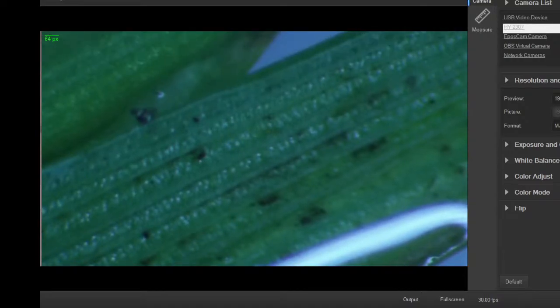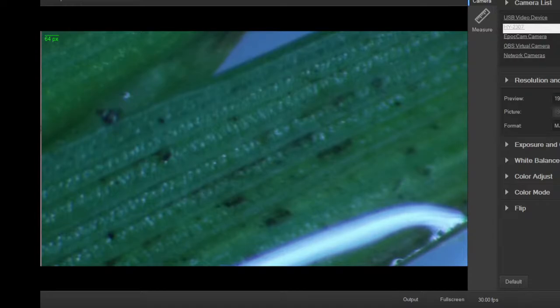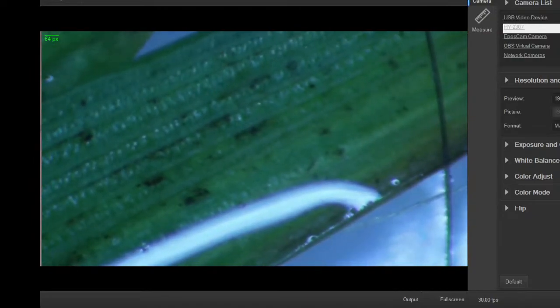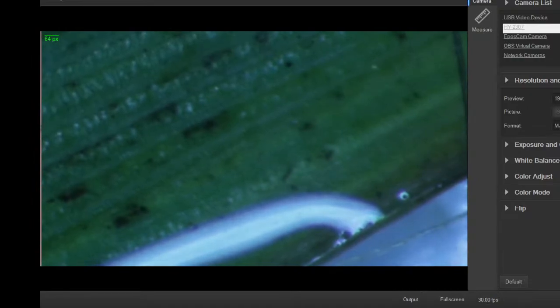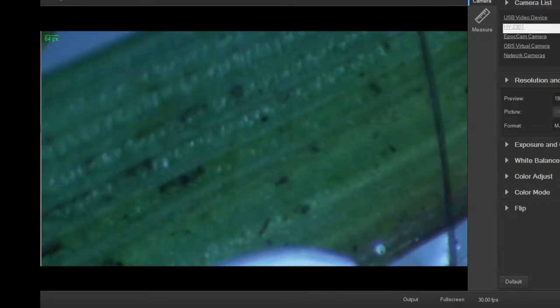Yeah, there is some stuff swimming there. Look at that. What is that swimming over there? That might be a very large ciliate. This is fun about this kind of scope. As you can see, ciliates, with that light passing through them, you see them kind of as they are, with ambient light, not just light going through them. Yeah, that's cool. Hard to make out the details, but that is a little ciliate swimming on the grass. Submerged grass.